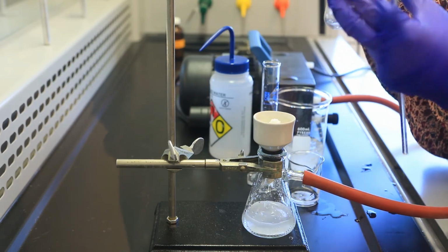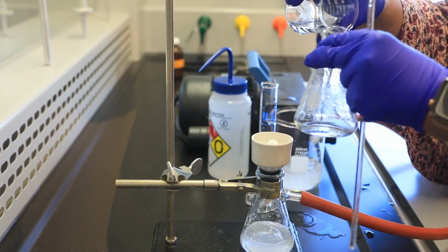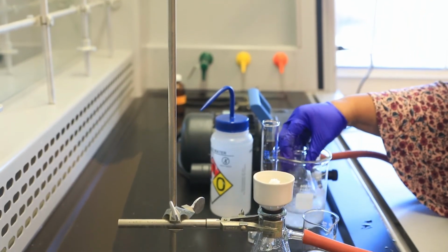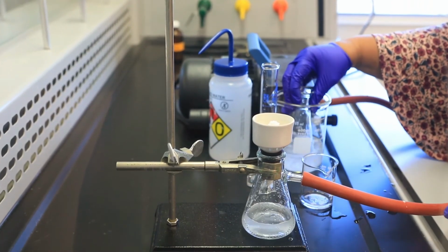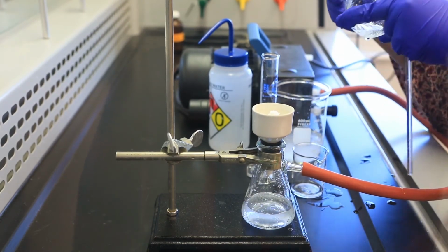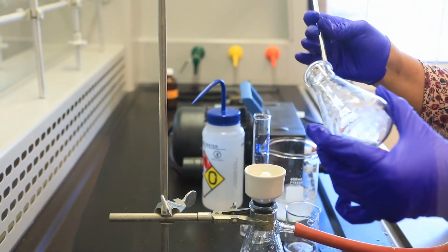Perfect. And you can go ahead and just add no more than 1 or 2 ml at a time. We also don't want to add too much water, because we want to make sure that we avoid dissolving our crystals. At each step along the way, please note that I'm using cold water. So this water is actually extremely cold. And then again, I want to do my best to make sure that we're removing as many crystals as possible.